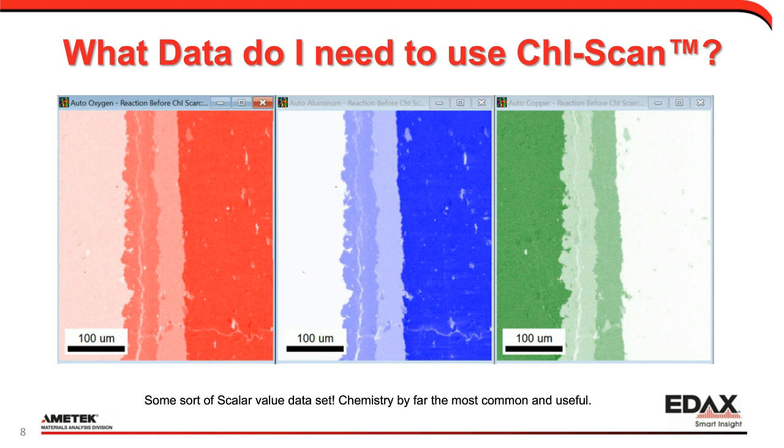And if I have that data set, this gives me that filter where I can choose what I'm using to index. Am I filtering my data by saying, okay, this point has high iron, use my iron phase. My other area has high copper, let me go ahead and use my copper phase. And by far, chemistry is the most common, useful.